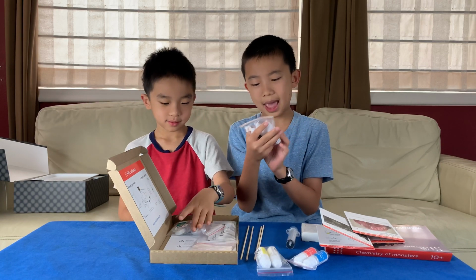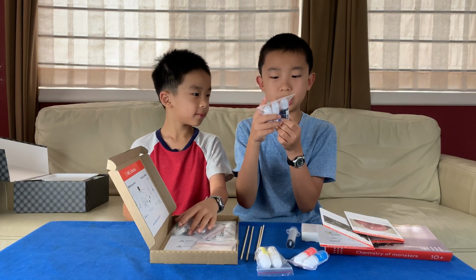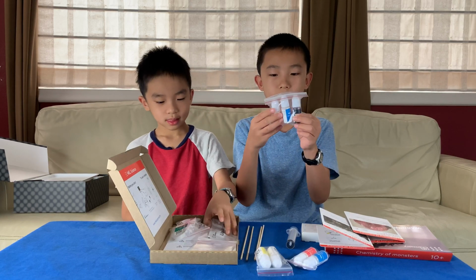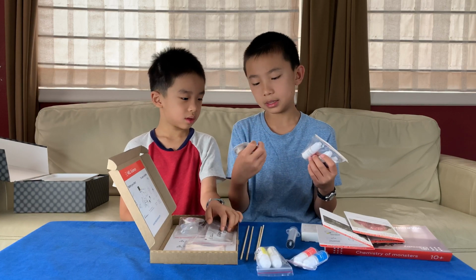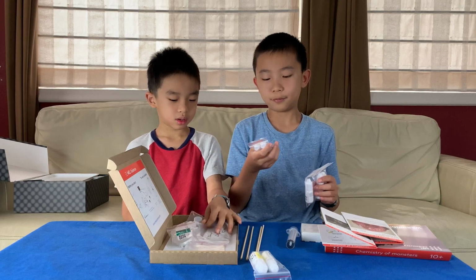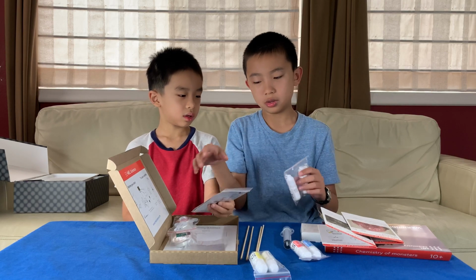And there's also anthocyanin, which is in the black bottle. And this one is not hazardous because it is a food colorant. So I guess they put it in food. So the only hazardous substances in this one look like the citric acid and the sodium carbonate, and they're only harmful if they're in our eyes. But that's fine because we'll be wearing protective goggles.